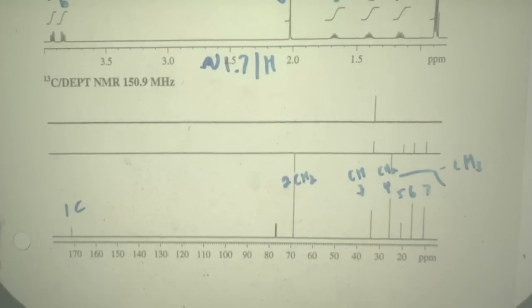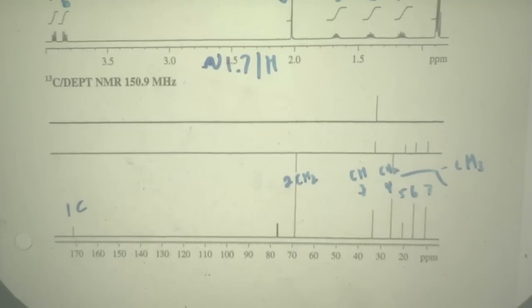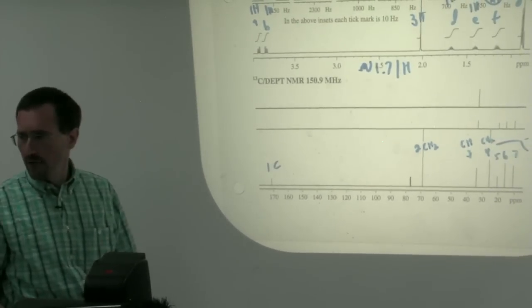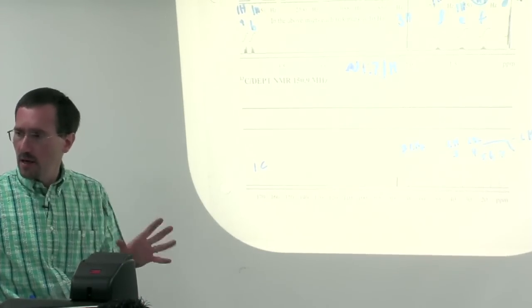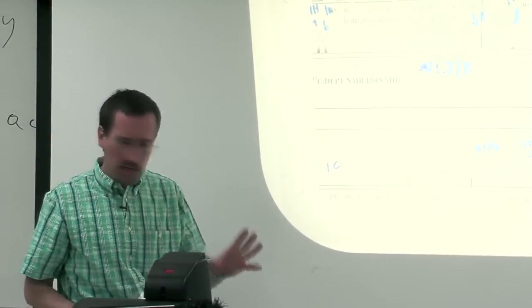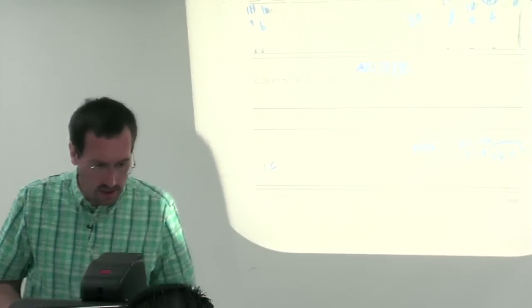Now, with these data alone, this is at the harder end of a molecule to solve with just 1D data. It's not that you can't. You could easily puzzle out the structure, but I want to show us how 2D data is going to help us.